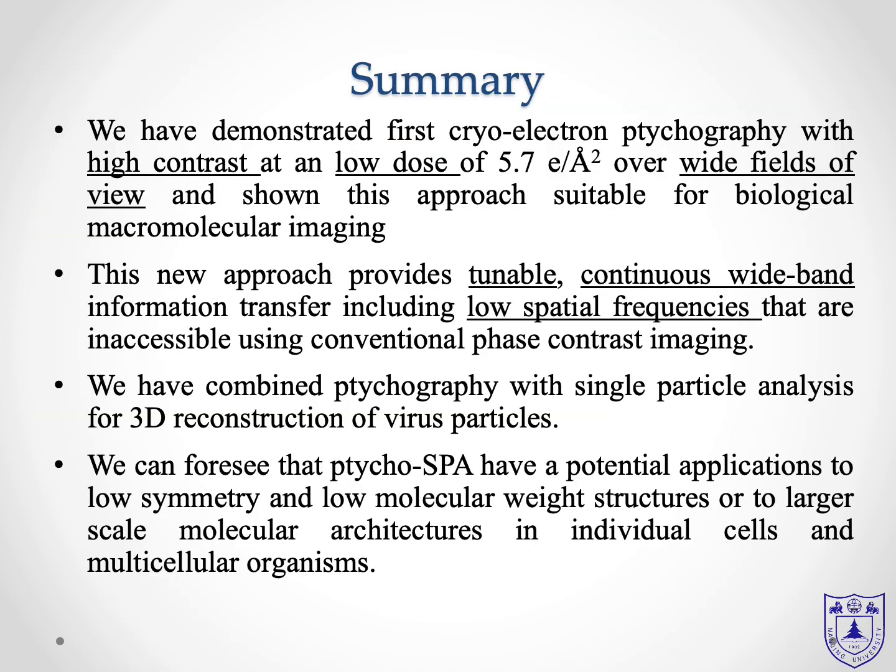So here is the summary. We have shown first the cryo-electron ptychography with high contrast at low dose, as low as 5.7 electrons per angstrom squared, and we have shown this method is suitable for biological imaging. This new approach provides tunable continuous wideband information transfer, including low spatial frequency that is not accessible using conventional TEM phase imaging.